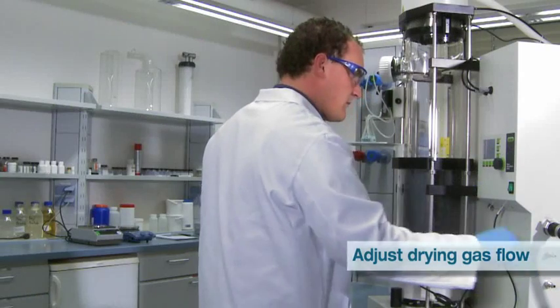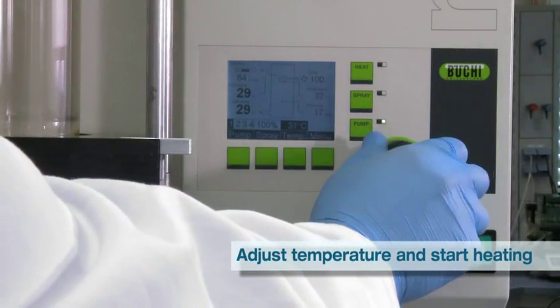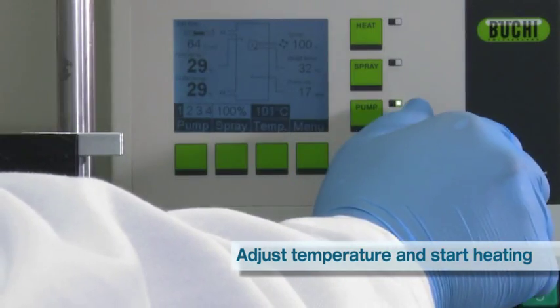Adjust the spray gas flow. Adjust the temperature by pressing the Temp button and turning the knob. Turn on the heater by pressing the heat button.